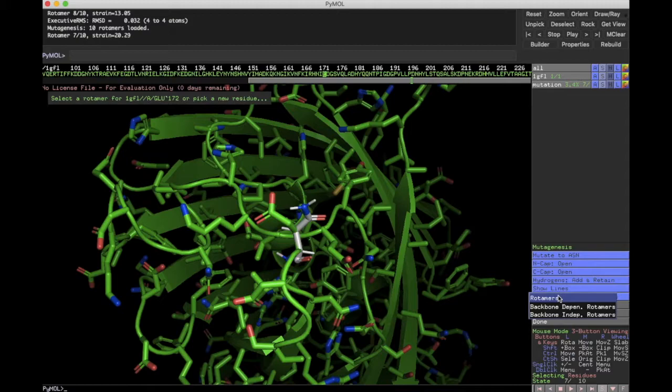You can have rotamers, meaning you're basically rotating the backbone here. You can be independent of the backbone, or you can be dependent on the backbone, and then you can have caps on your amino acids, right? Because we're in line, we're actually in the protein, we don't really want to put a specific cap on either the N, the amino end, or the carboxyl end, because that's going to terminate and separate it from the amino acid chain. So we're just going to leave this open. It's going to fit into the chain here.